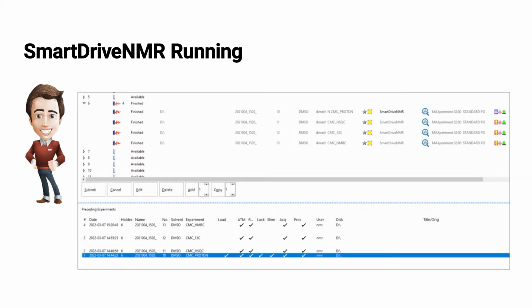Now, once the SmartDrive run evolves, each experiment of the SmartDrive portfolio is carried out one by one. And with the portfolio we are using here, which is a standard portfolio, there is a proton carried out, then an HSQC, a 13C 1D, and an HMBC. Here at this stage, we're just finished with that.